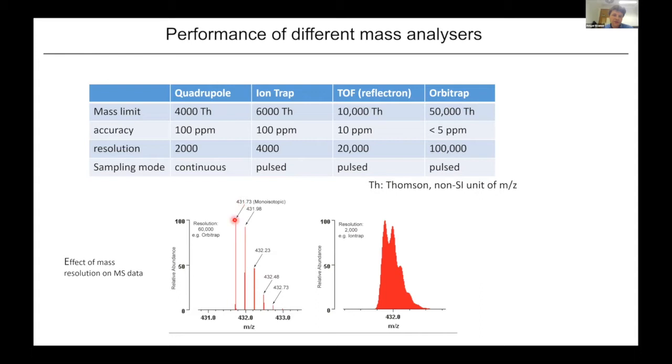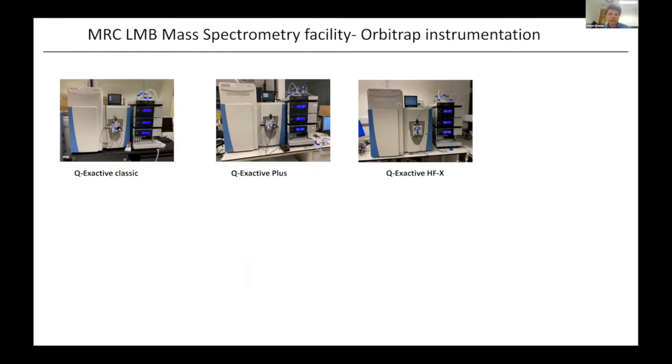The first of this distribution of peaks is referred to as the monoisotopic peak. Then we've got the C13 peak, or the +1 peak, with one heavy carbon 13, or generally one heavy isotope, and so on. There's the next one with 2, 3, and 4 heavy isotopes respectively. Essentially, the bottom line here is that in order to be able to resolve this kind of isotopic peak pattern, we require sufficient mass resolution.